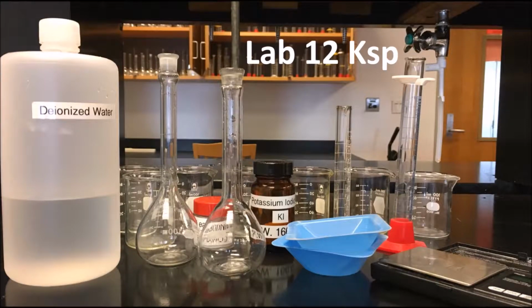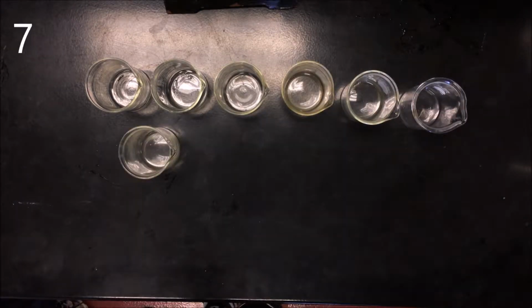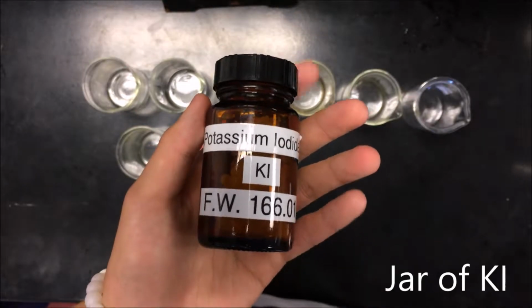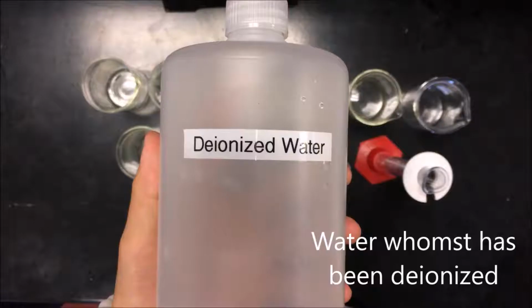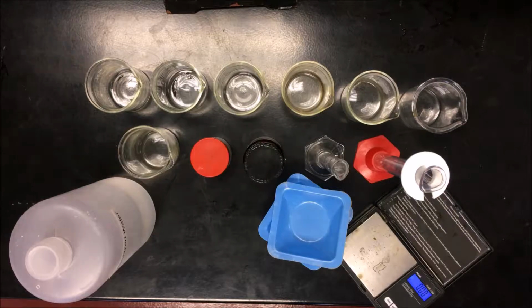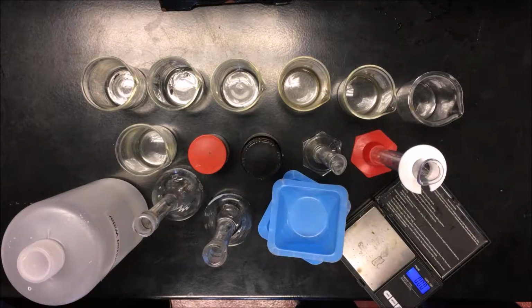Lab 12 Ksp Determination. For this lab, you will need 7 100ml beakers, a jar of lead-2 nitrate, a jar of potassium iodide, 2 10ml and 25ml graduated cylinders, deionized water, a weighing scale, and 2 100ml volumetric flasks.